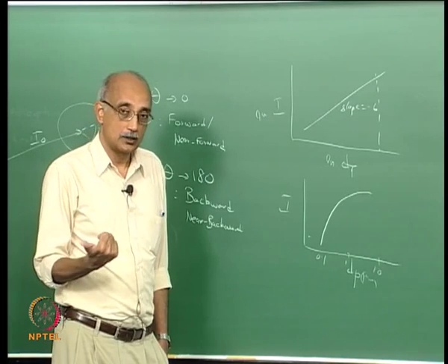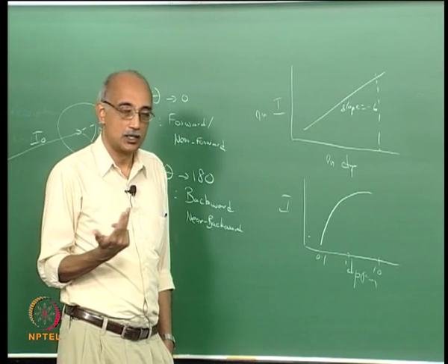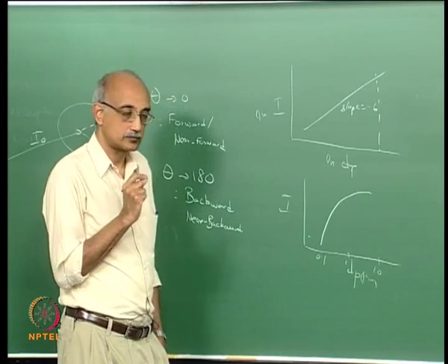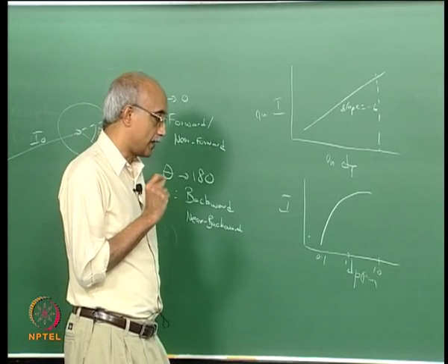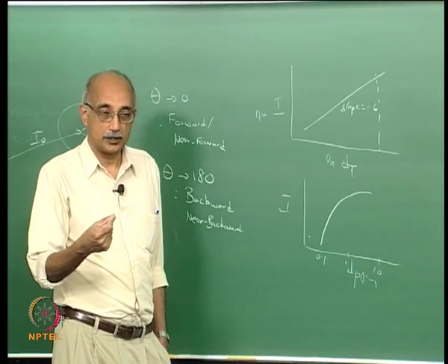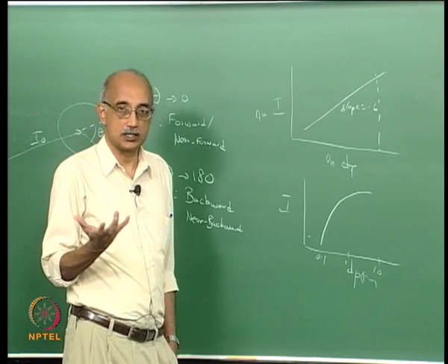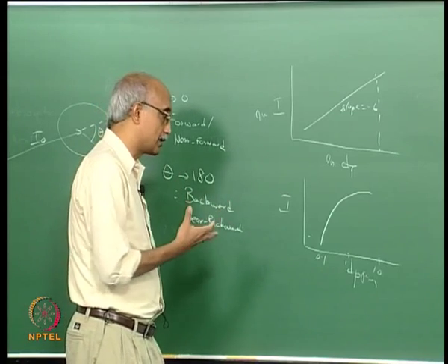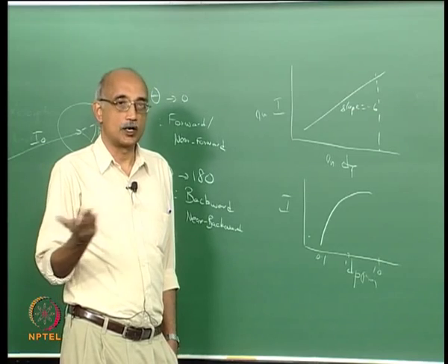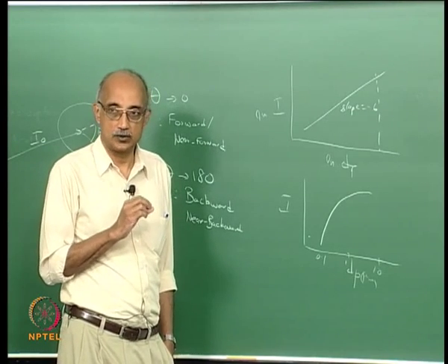It's an overkill, and it's statistically not very reliable because of the time involved in analyzing a single particle. The fact that you have to analyze multiple particles and get some statistics means that even if you have 100 particles in a sample and you do size analysis using microscopic techniques, it's going to take you forever, and it's not a justifiable investment of your time or cost.